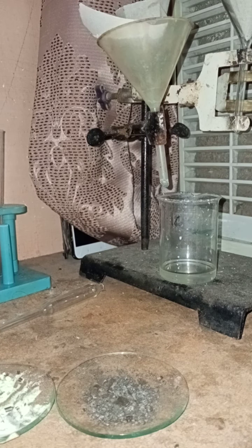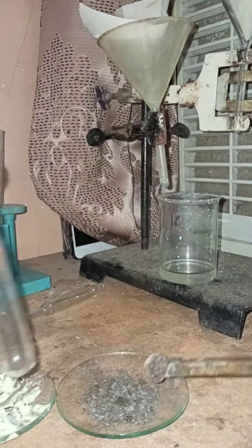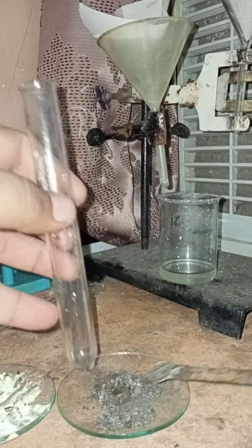But now let us try to add this iron sulfide to the carbon disulfide, and let us see what happens.